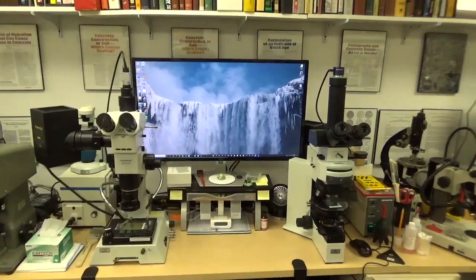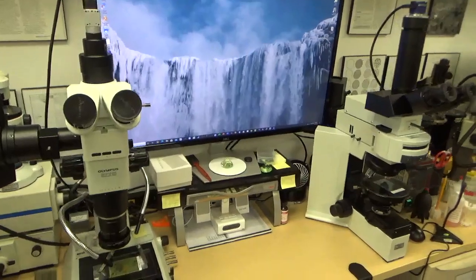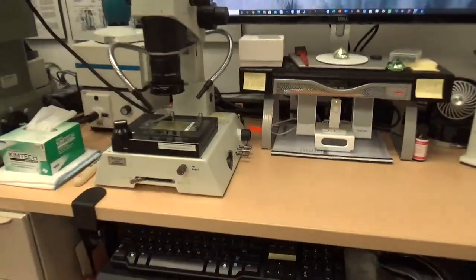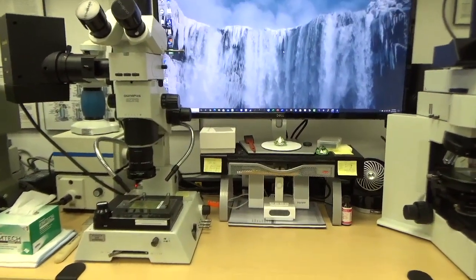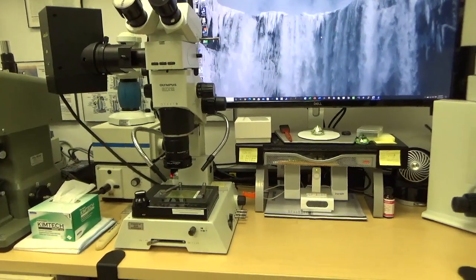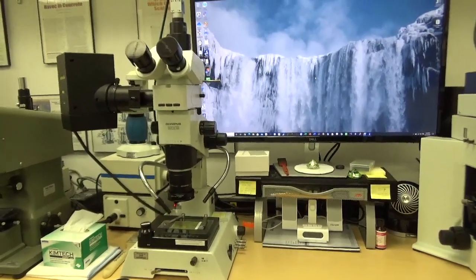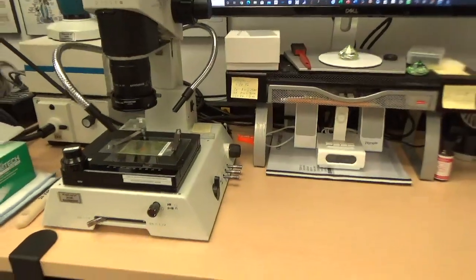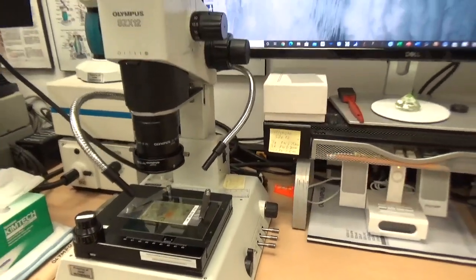Here is a tutorial of how we scan a thin section of rock or concrete using a whole slide scanning software from Microvisioneer. It's called manualWSI, whole slide imaging software. We use that to scan a 50 by 75 millimeter thin section of concrete or rock on a stereo microscope.